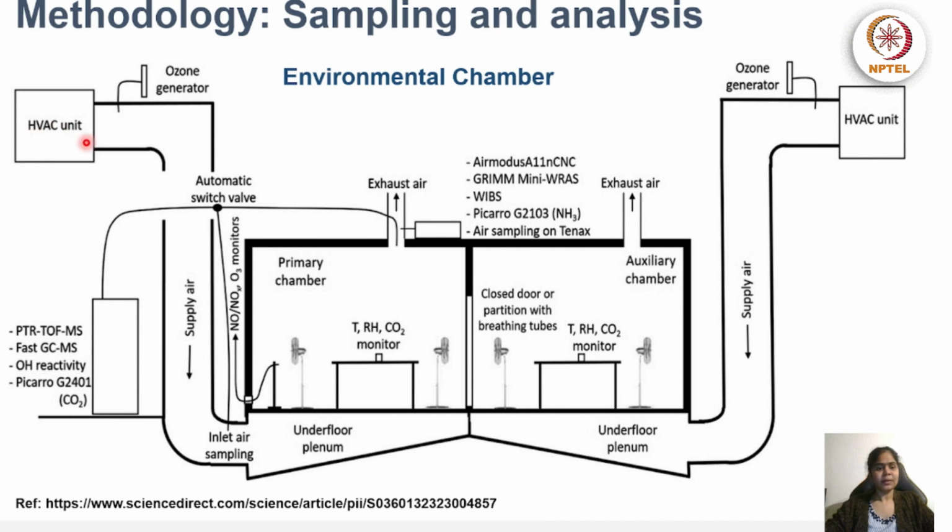If you see here, the outdoor air is introduced through the base of the chamber, and it was exhausted to the upper ceiling. You could ask me, okay, you are introducing outdoor air, so it might introduce some outdoor bioaerosols. How can you say it's not affecting? Here, to avoid that scenario, the air which is introduced from the outdoor is filtered in 4 different stages. So we made sure that nothing comes from the outdoor. I'm not saying it's 100% clean air, it might be 99.9%. So the outdoor air is introduced through this platform, and it comes to the indoor and it goes away.